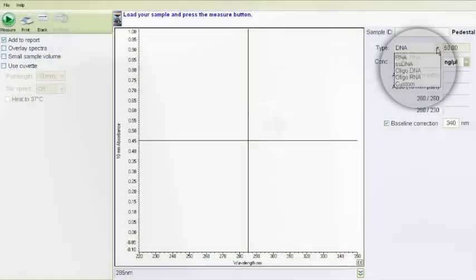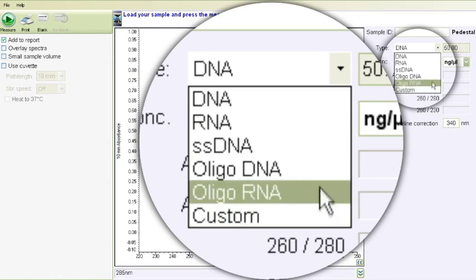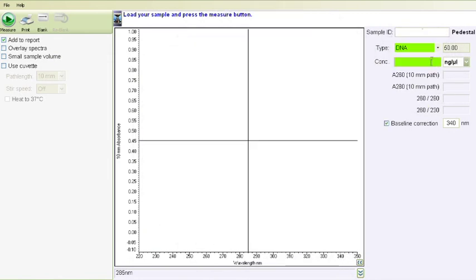Once the blank measurement is complete, clean both optical surfaces with a laboratory wipe as before. Choose the appropriate constant for the sample that is to be measured.